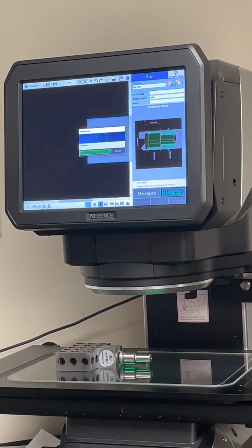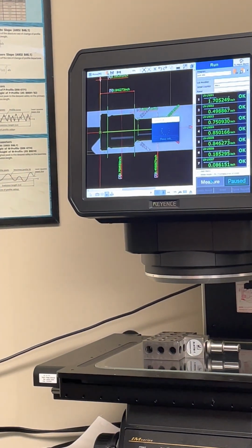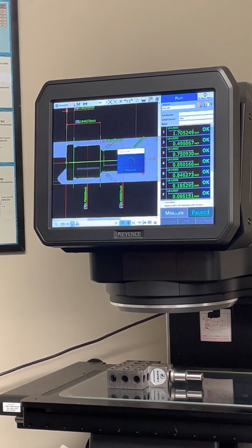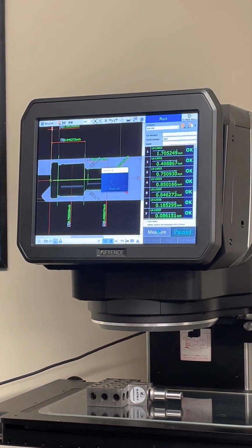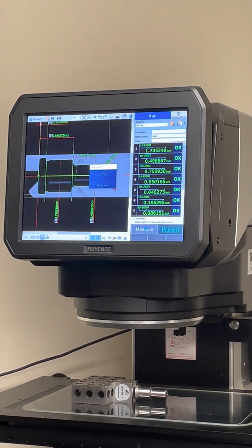So it'll change this view several times through the measurement. It doesn't measure all of one depth and then all of the other. Now it's going to go to a certain area, measure the depth, refocus, move over, do that, move over.